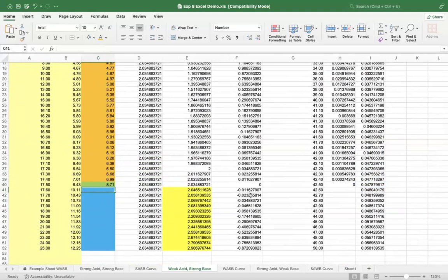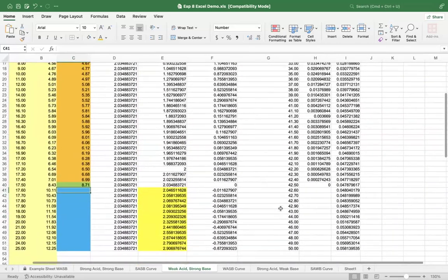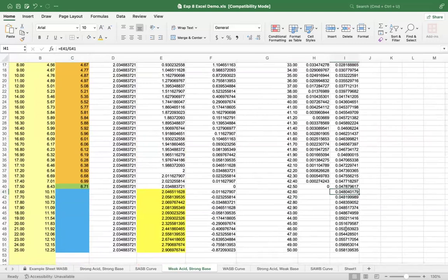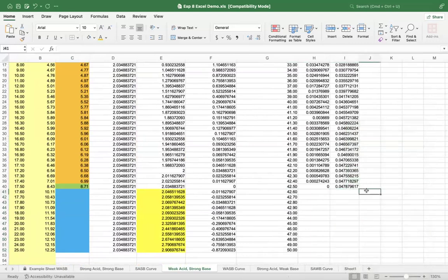All right. Now we have just excess base. We've neutralized all of the acid, and now we're just adding sodium hydroxide. So we can calculate the pH based on just the amount of sodium hydroxide that's there, the pOH. I need to make sure I have a concentration of sodium hydroxide here somewhere that I can look at, because I don't think that's what this is. No, we need to look at the excess now. So I'm gonna delete all these numbers right here. We don't need them. They don't mean anything. But I'm gonna repurpose this and have this be where I have my OH concentration. Just make that yellow.